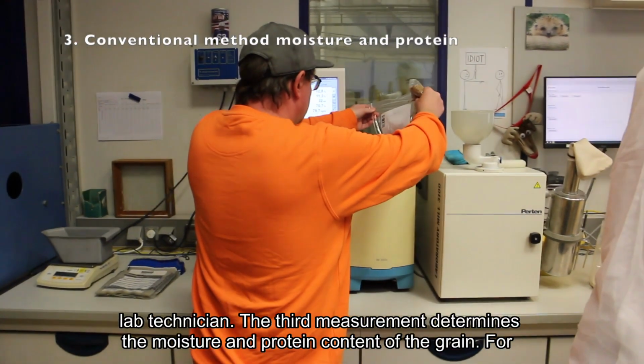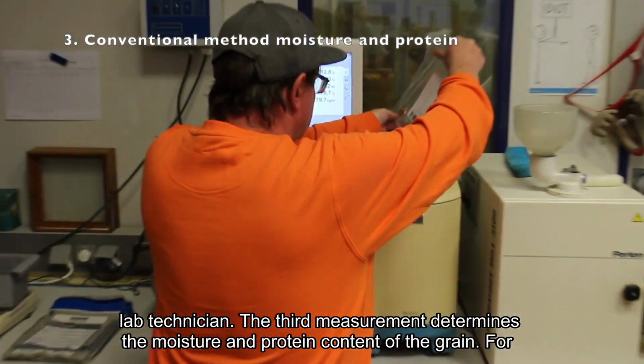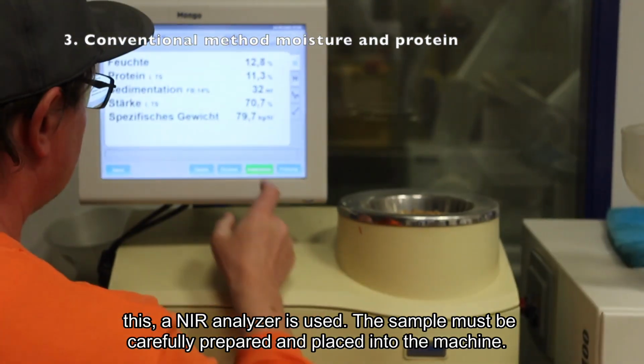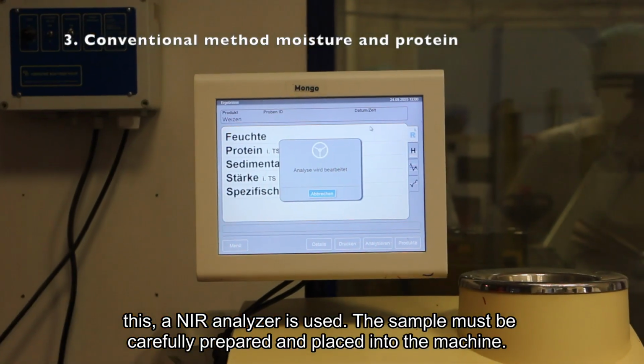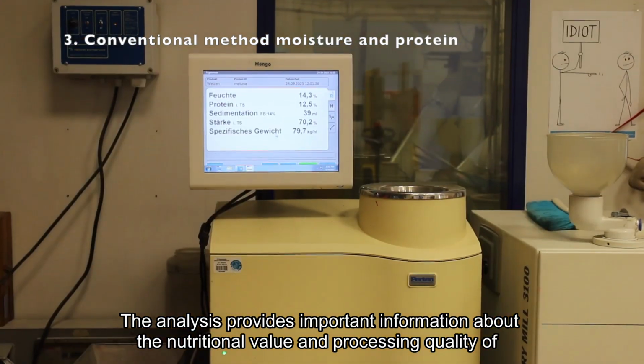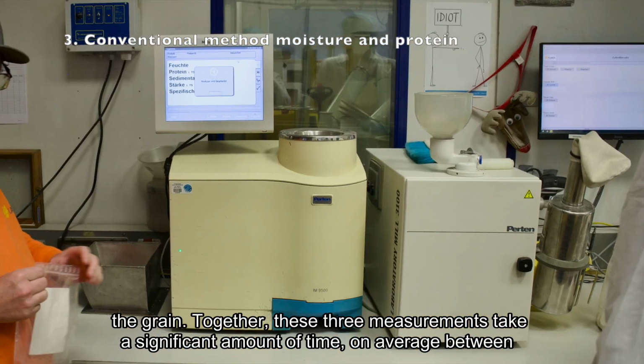The third measurement determines the moisture and protein content of the grain. For this, a NIR analyzer is used. The sample must be carefully prepared and placed into the machine. The analysis provides important information about the nutritional value and processing quality of the grain.